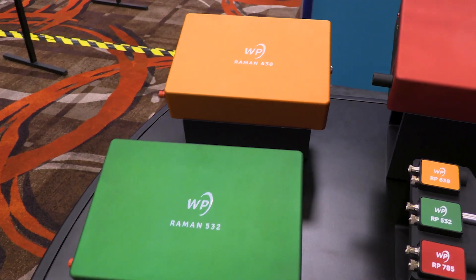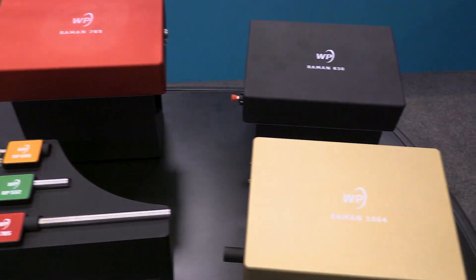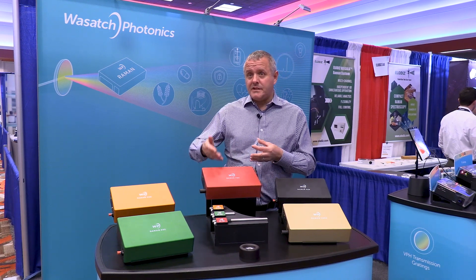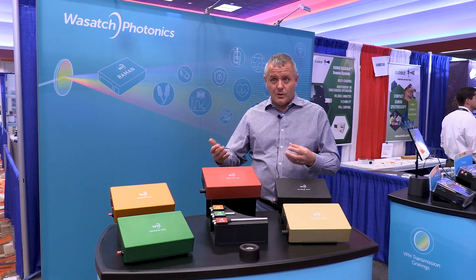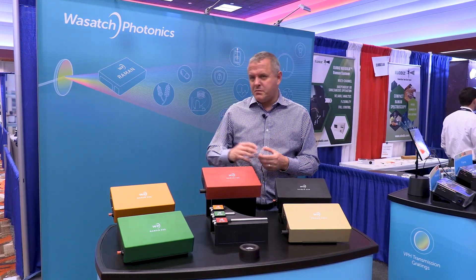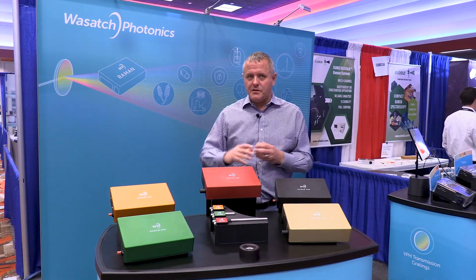You can see we've got multiple different wavelengths. The Raman effect changes with laser wavelength, you need to account for the fluorescence of your sample which also changes with wavelength, and you've got sensitivity which changes with wavelength — so having each of those options is really important. We also have more traditional configurable aspects such as the optical slit, which is the traditional way to look at the trade-off between optical resolution and throughput.